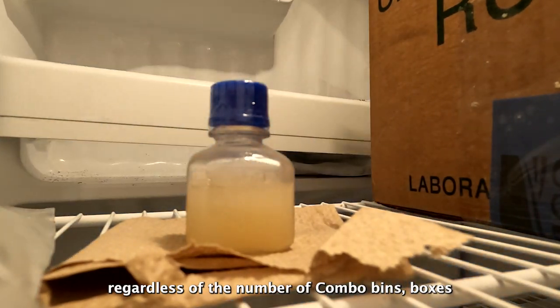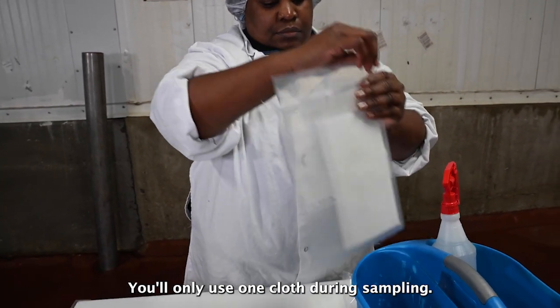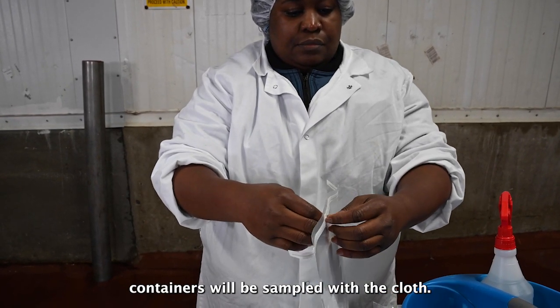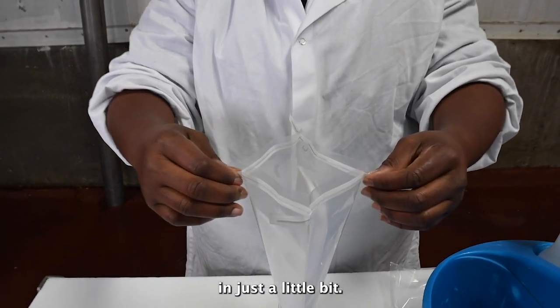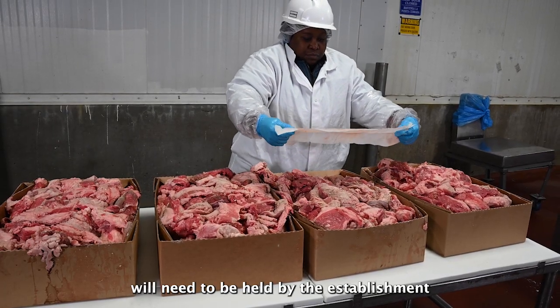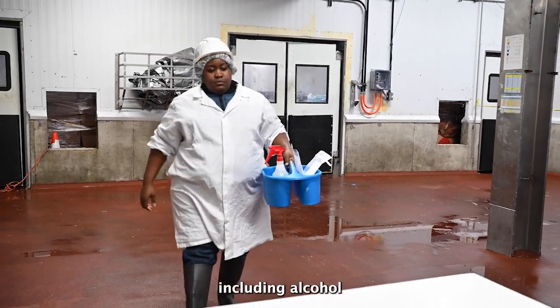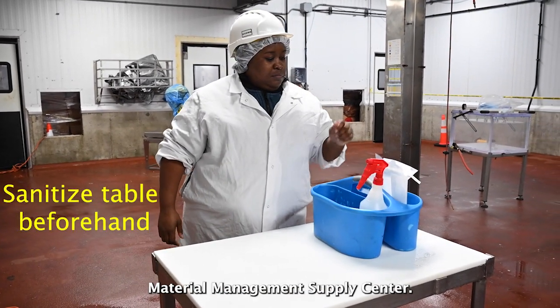Regardless of the number of combo bins, boxes, or containers in the lot, you'll only use one cloth during sampling. Only one combo bin or up to five boxes or containers will be sampled with the cloth. All the product in the sampled lot will need to be held by the establishment pending test results. Carry your sampling supplies to the sampling area, including the alcohol-based sanitizer spray ordered from the FSIS Material Management Supply Center.